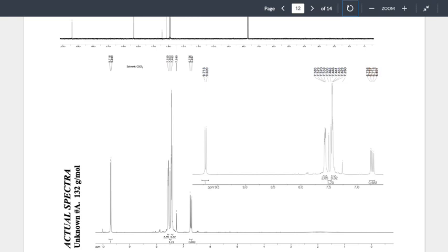How long have we had that technology? 80 years. NMR itself, HNMR, is maybe 85 years old. So being able to pull integration information off, we've known for a long time and we've had the computer ability to do it. Why am I mentioning it and getting mildly irritated about it? Back to Joshua's question about how the integration information is going to be given to us.